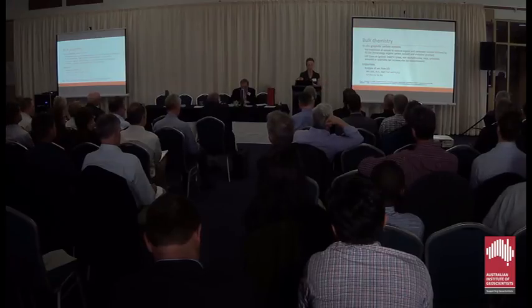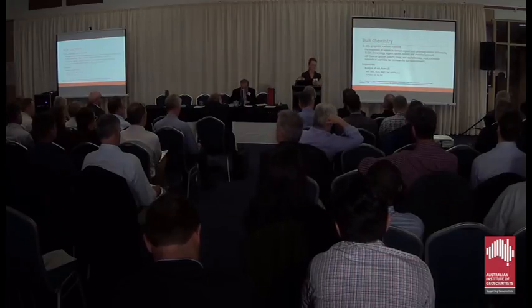The same applies to organic material. The time that is allocated for pre-ashing, for example, of organic may not be enough to remove all these impurities, and that will affect the final analysis with the carbon sulfur analyzer. Using appropriate reference materials is very important. They should ideally match your sample as well. So if you have a complex mineralogy in your sample, try to choose reference materials that match the matrix the best.